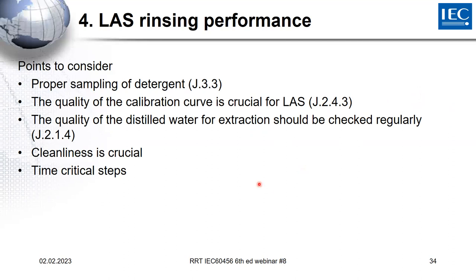May I add something? Yes, of course, Markus. Because we had such a problem because we are using such ion exchangers. So do not only check it regularly, check each batch which you are preparing. And it's better to prepare a big batch of distilled water and then check it once, and not to always prepare 1 liter after the other and not check every batch.